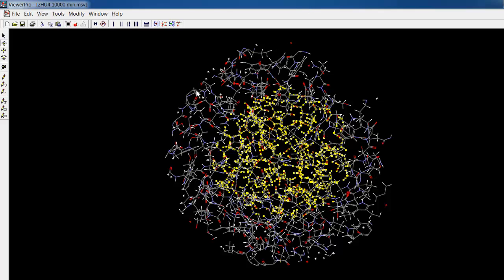Because the perimeter outside of that doesn't really engage in any significant conformational changes when the Tamiflu docks at the active site, we can more or less ignore that perimeter in order to simplify the model and thereby decrease the number of calculations and the time that the calculations require for this computer model to find an energy minimum.